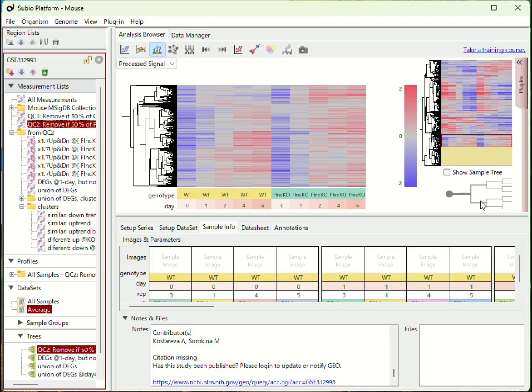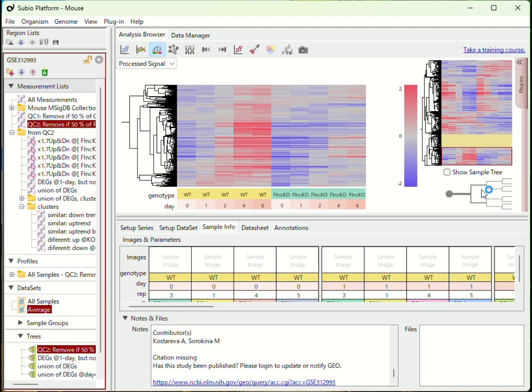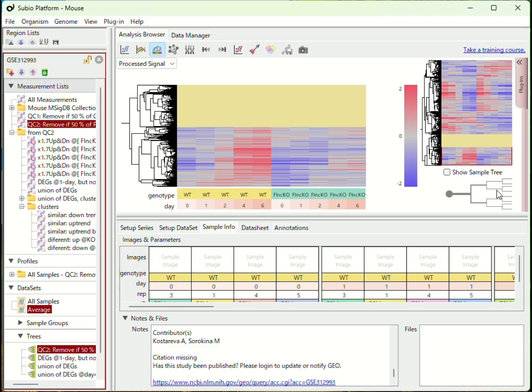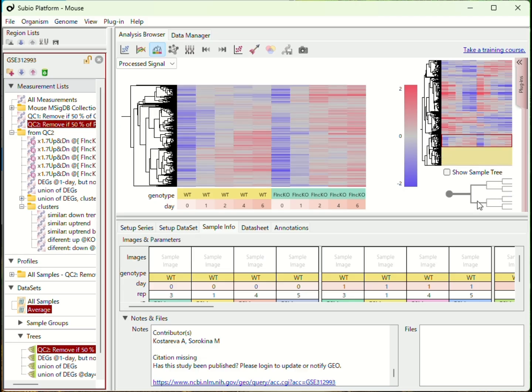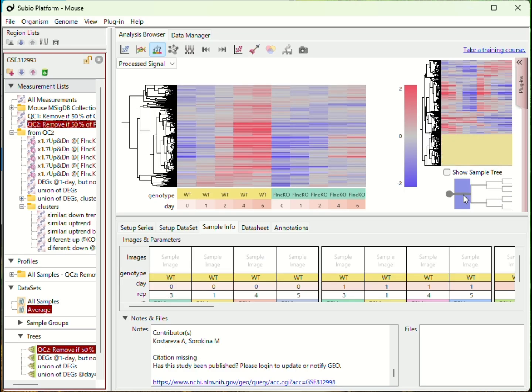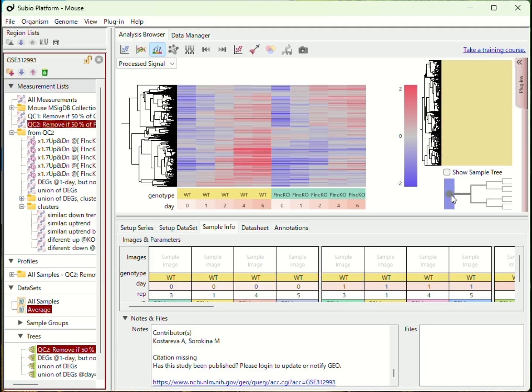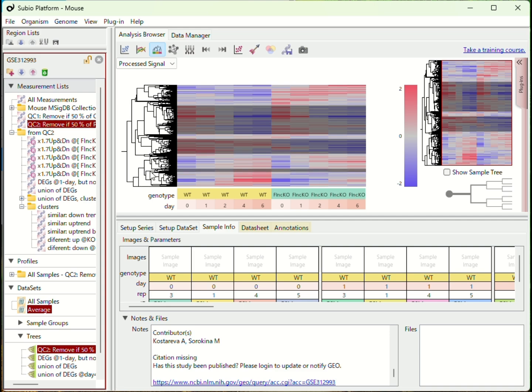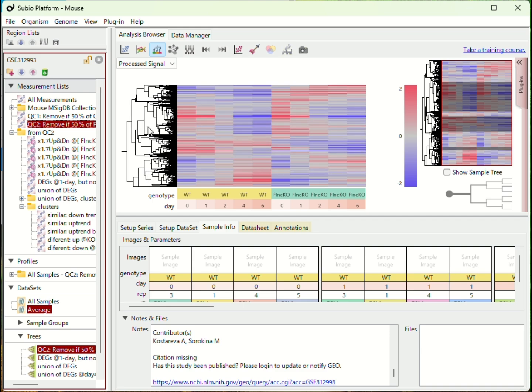Also, you can jump to the sibling node. And, of course, you can move up to the parent node. Now you know how to traverse tree nodes without zooming by double-clicking a node. Lastly, you can reset to show the root node with a single click. Furthermore, you can add to the selection by clicking while pressing the Shift key. Or you can invert the selection by pressing the Control key while clicking.